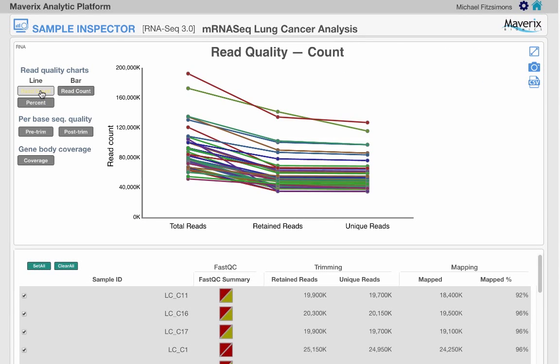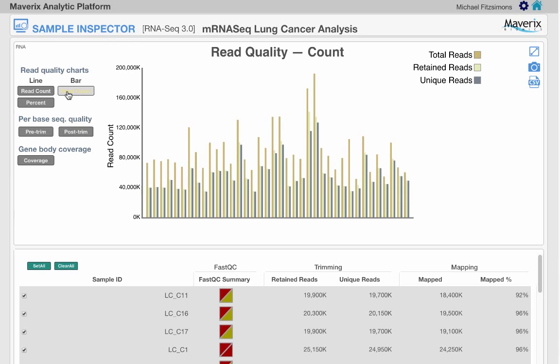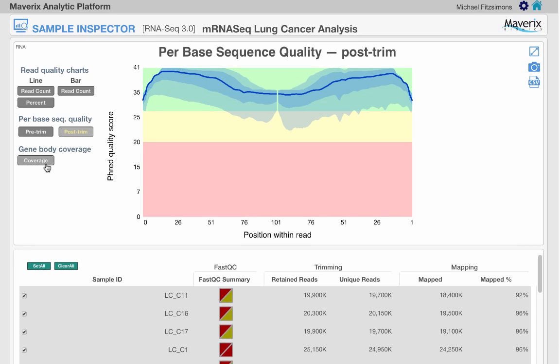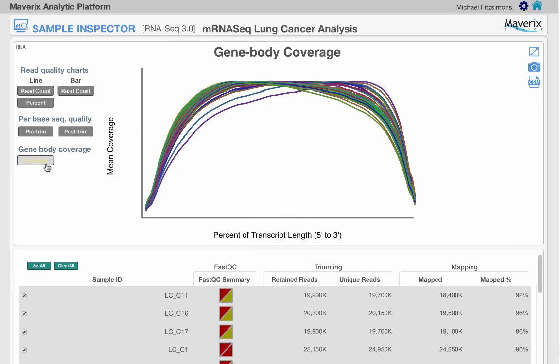Available charts include read counts in a few different formats, read quality for samples pre- and post-trimming, and finally a chart showing how evenly reads are distributed along a normalized transcript.